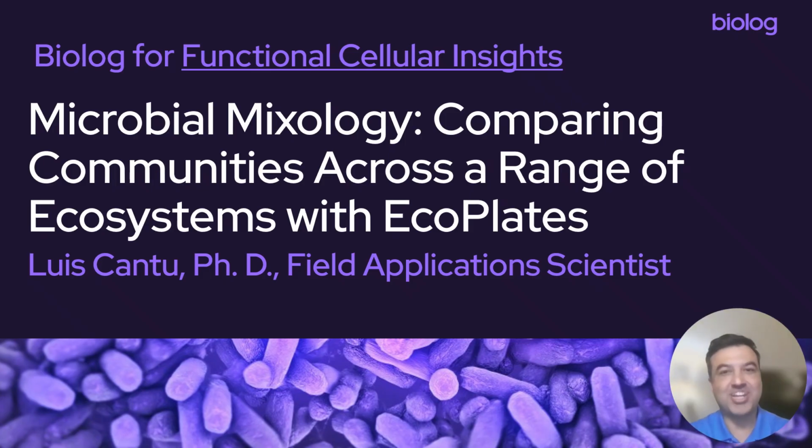Thanks for the introduction, Kasia. And thank you for joining this webinar. Today we're going to talk about how EcoPlates are used to compare microbial communities. They are really powerful tools for measuring microbial activity and to understand how these communities respond across different environmental conditions. Let's get started.